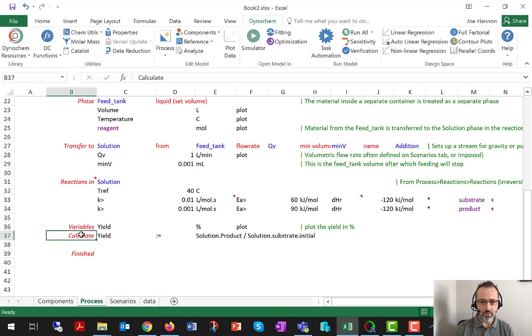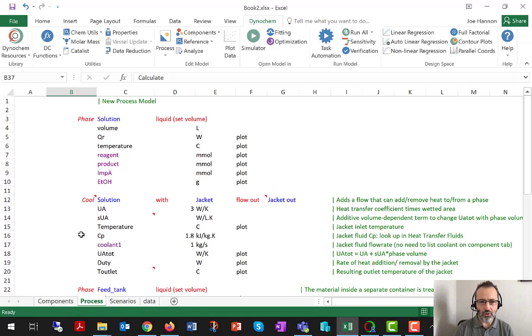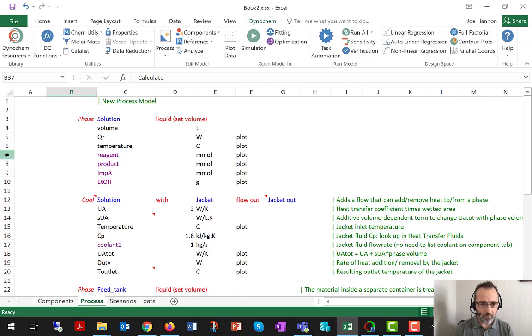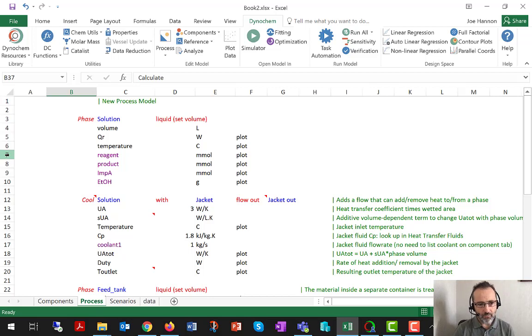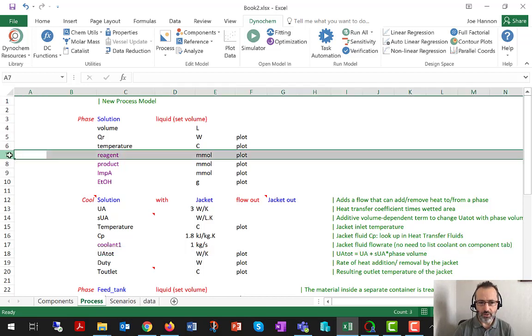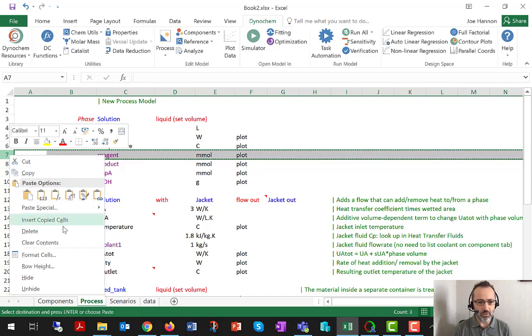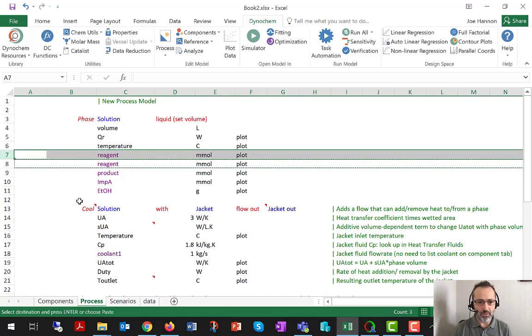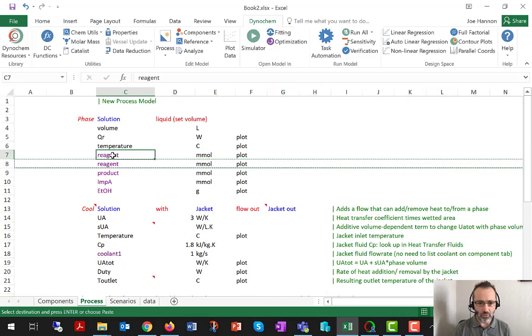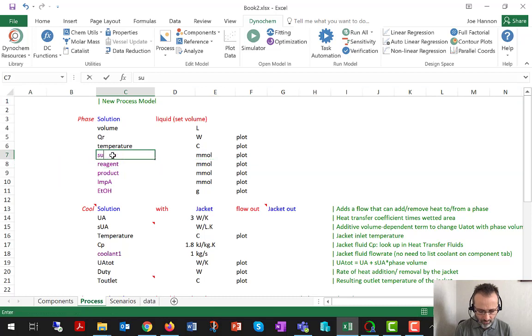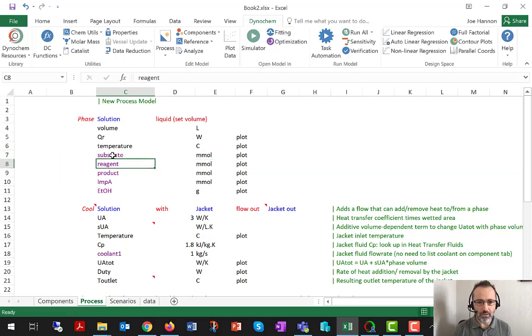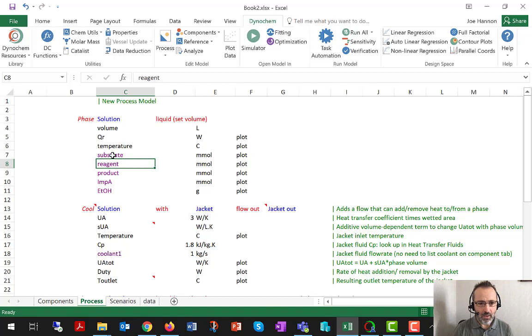So to the best practices, a casual reader of this model, looking just at the process tab, might not realize from the process tab that substrate is present in the solution phase. So a best practice I would usually apply is to make sure that all those components are listed in the solution phase. So I just did a copy and paste to make that work.